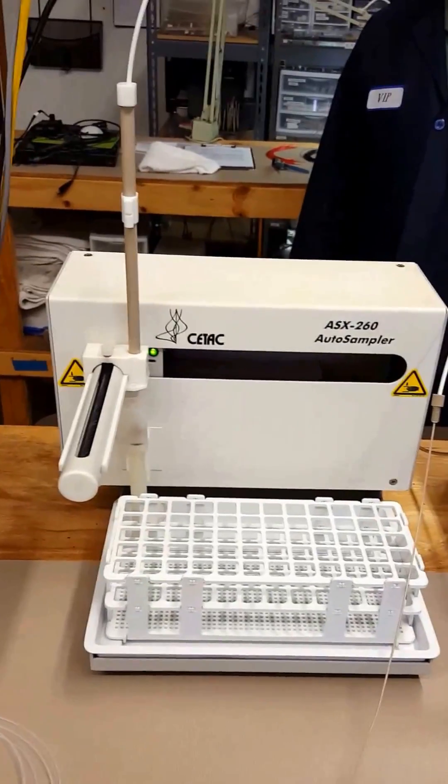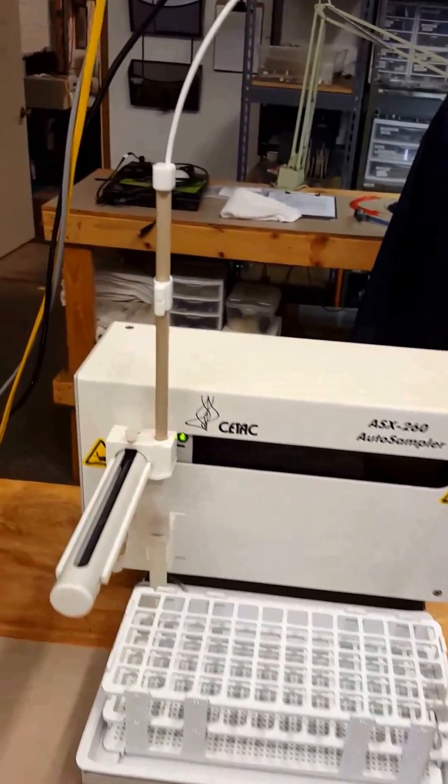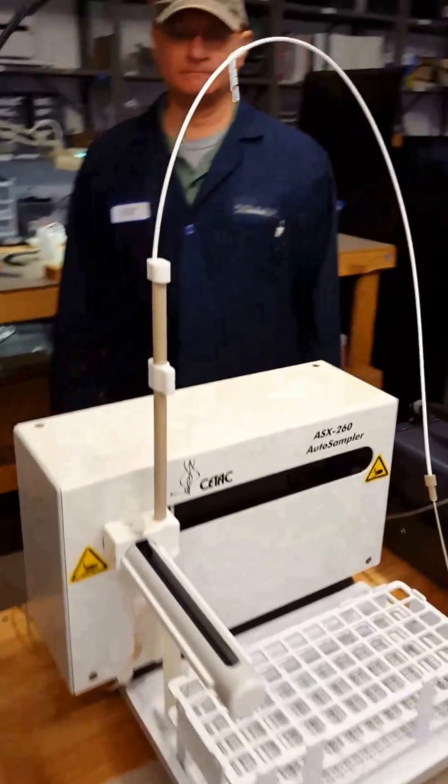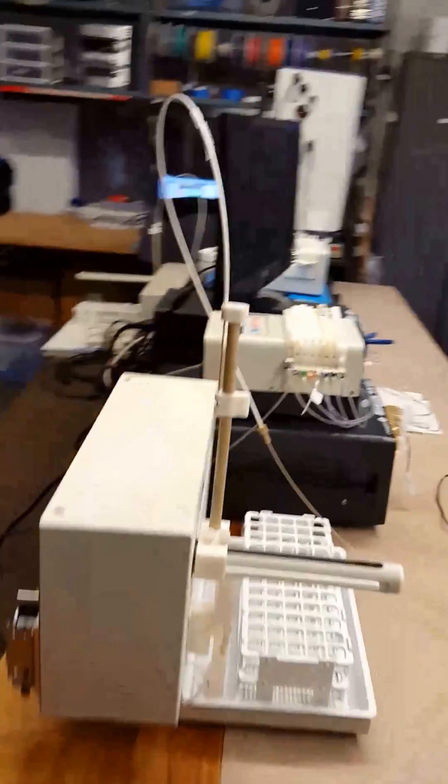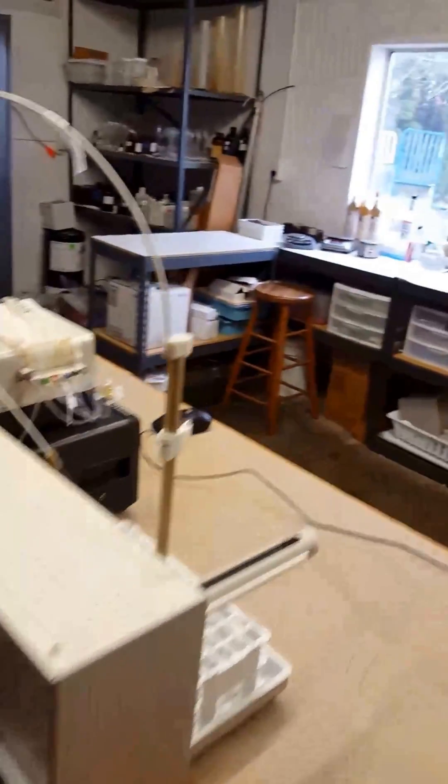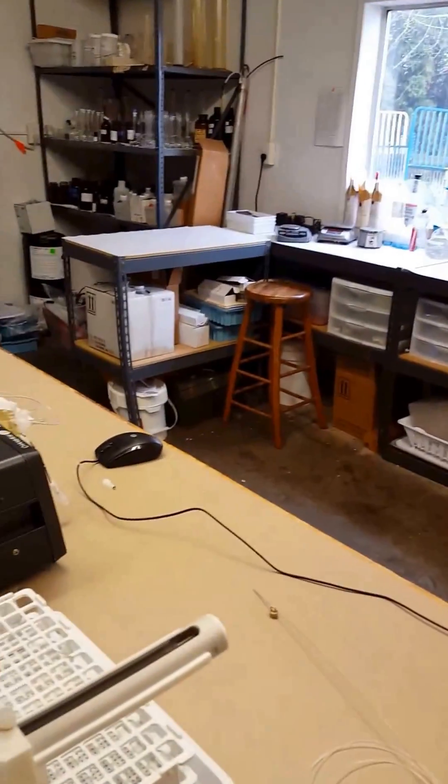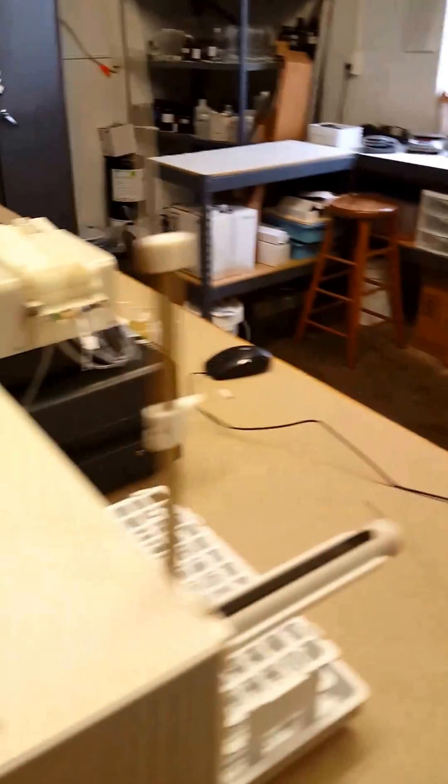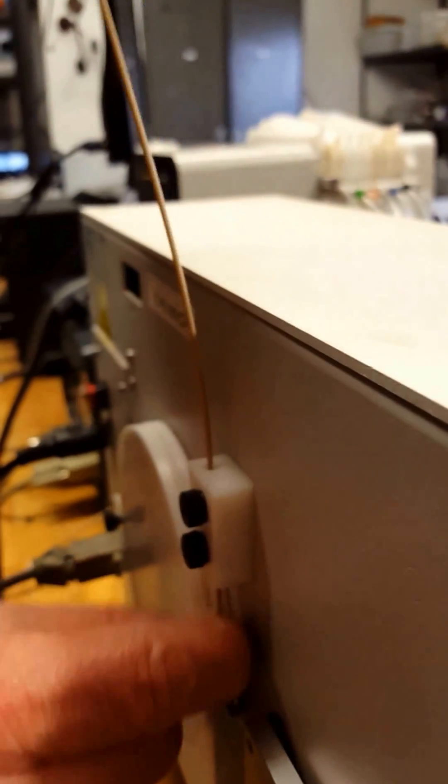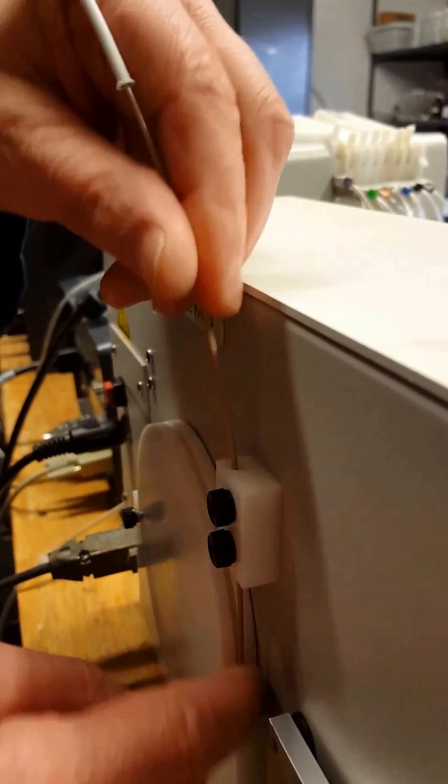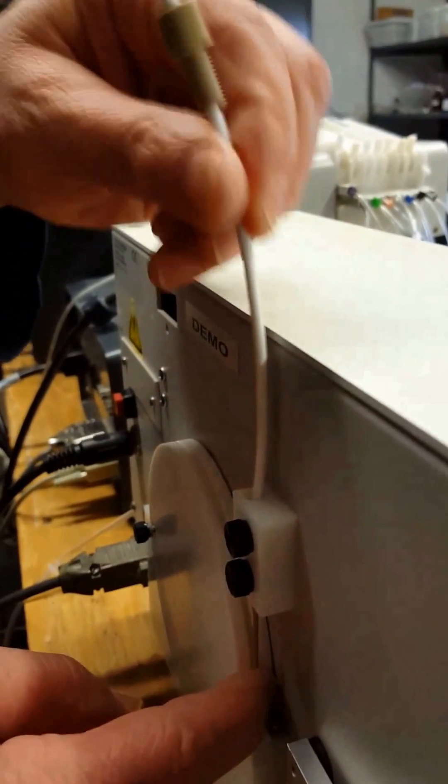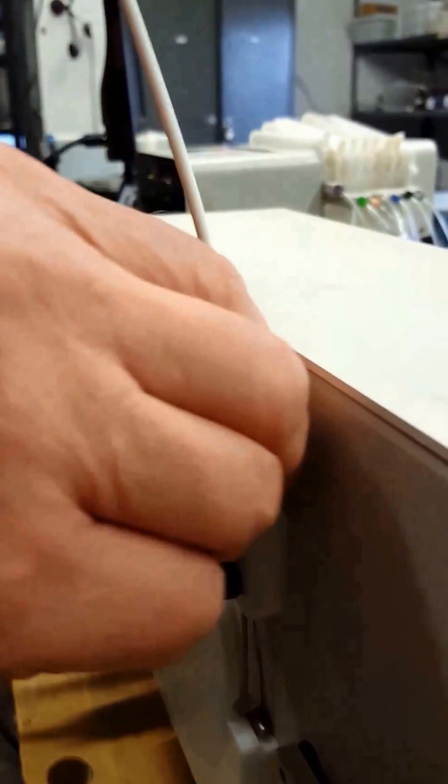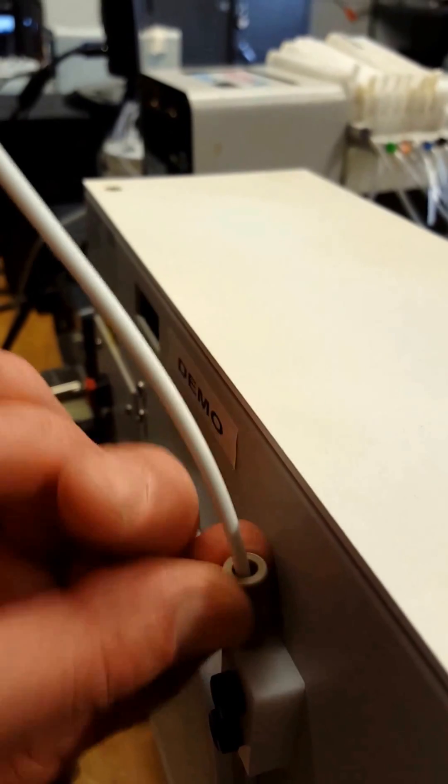Today we're going to show how to install and adjust the probe arm assembly on a SeaTac sampler. The first thing to do after installing the Z drive assembly is feed the PEEK tubing through the hole in the back, through the slot where the wheel is, and then secure the PEEK nut.